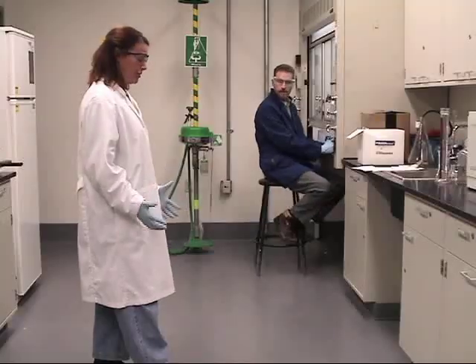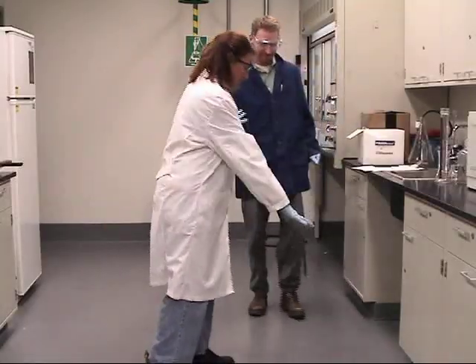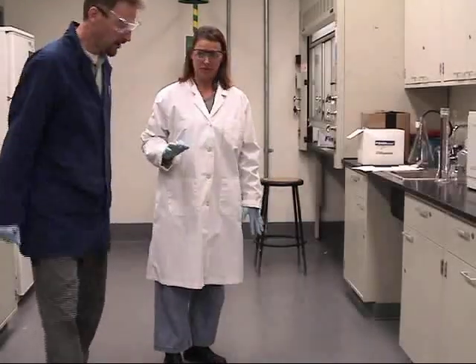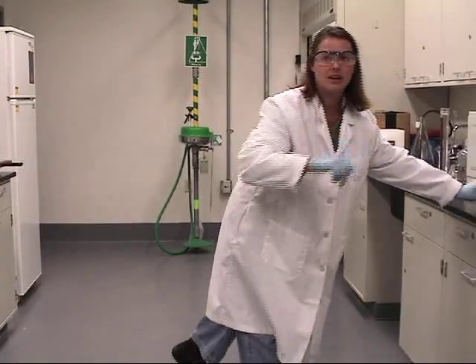This is the second mercury thermometer I've broken this week. Tim, I need your help. Please don't walk through there. If you could walk around and keep people out of the room, that would be really helpful. I saw EH&S clean this up last week — I think I can handle it, but maybe we'll have to call them. If you could put a sign up, that would be great.